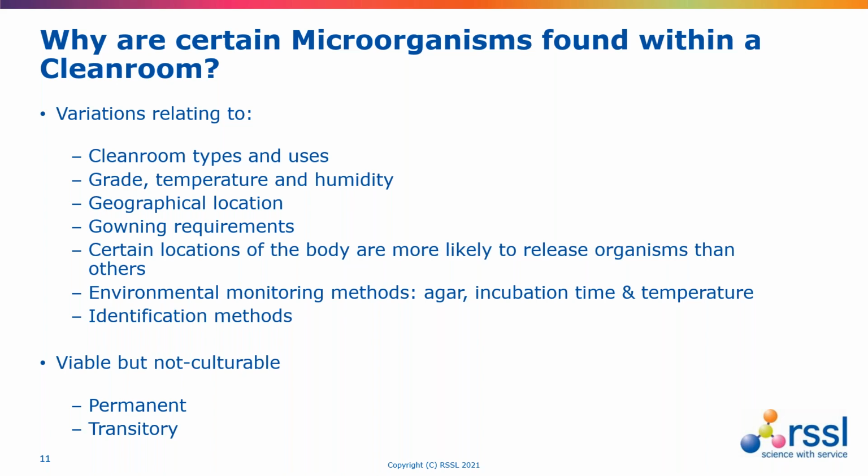Whether microorganisms survive within clean room environments will depend upon the types of microorganisms, the environmental conditions, whether there is a survival strategy in place or not, the level of available nutrients, and so on. So there's a number of factors that need to be considered.